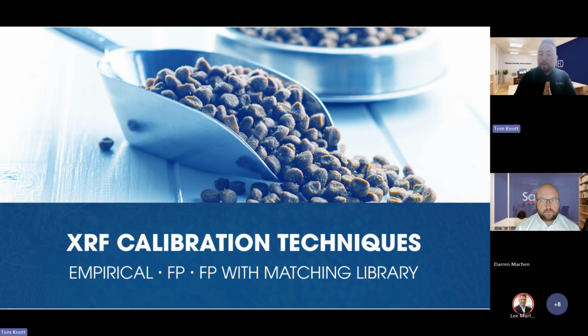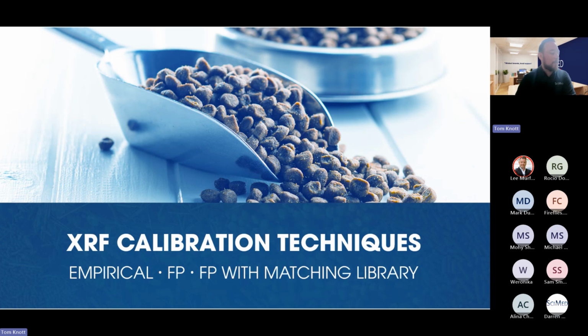So, sort of the second half of mine, before I pass over to Darren, I wanted to give a bit of a whistle-stop tour through where you would consider different XRF calibration techniques.